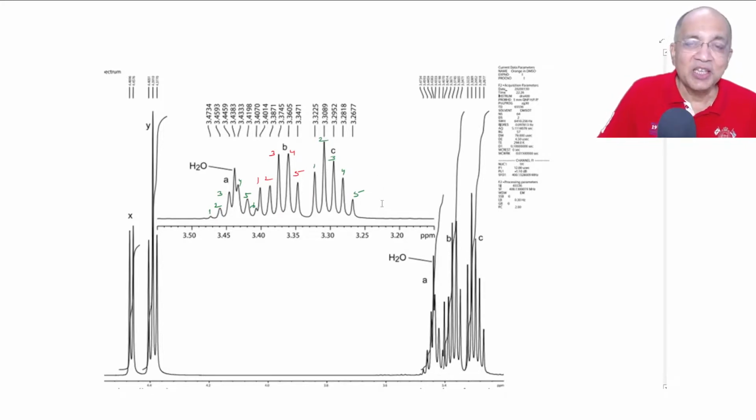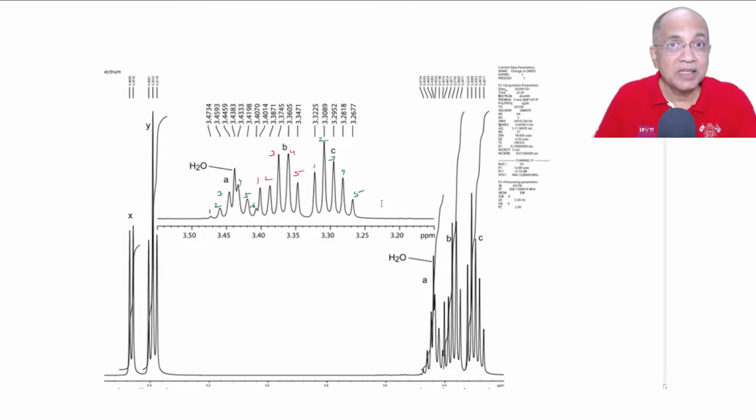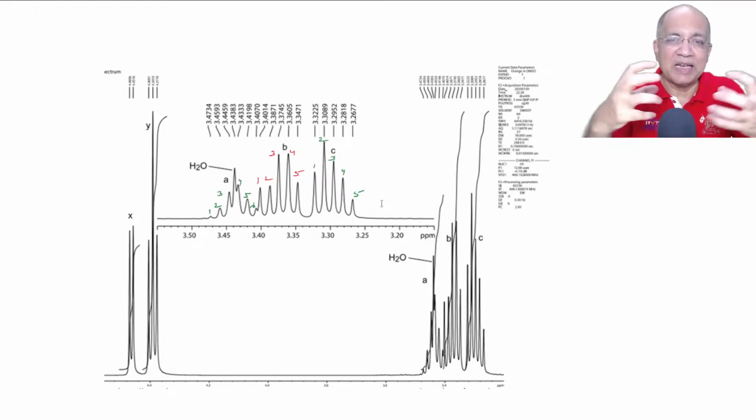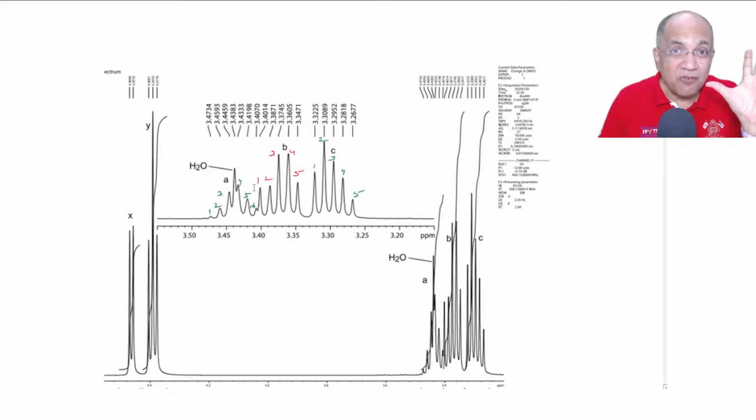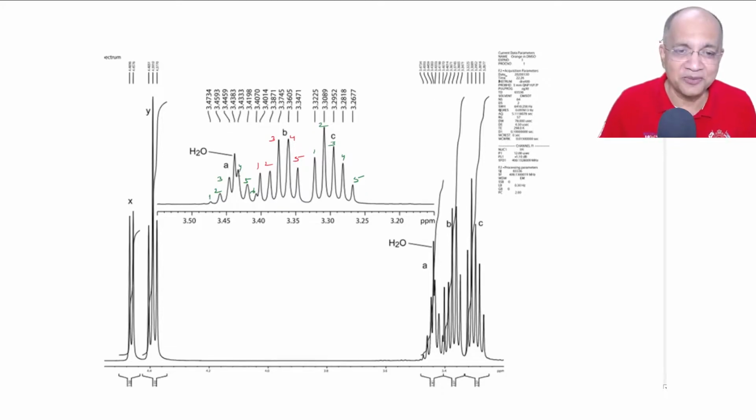You yourself will see, and tell me if you are really involved in this discussion. You'll tell me it cannot be 5 lines. Some merger, some coalescence of components, some lines has definitely happened, so that the number of lines has been reduced. You will tell me, and we will find out with our bit of common sense the J values, and we shall try to average it and present before the examiner, Professor Nowick.